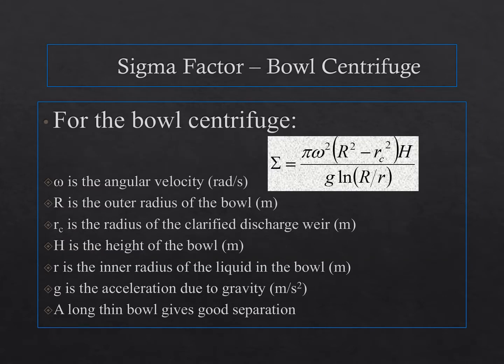Sigma factor of bowl centrifuge. This equation determines the sigma factor of the bowl centrifuge.